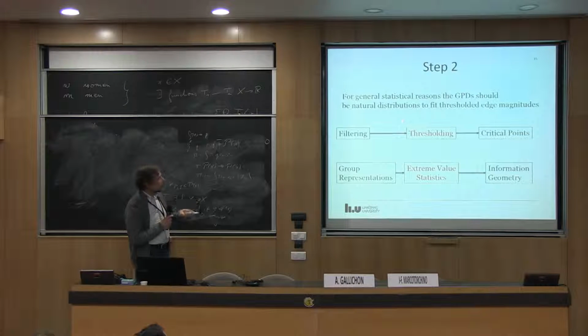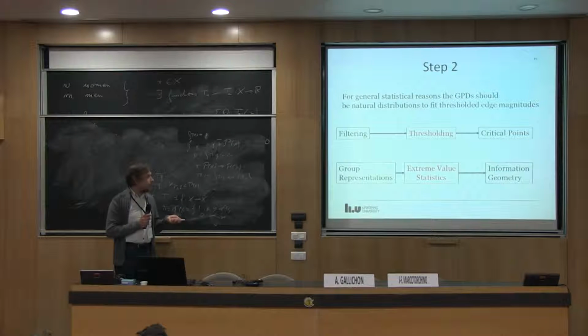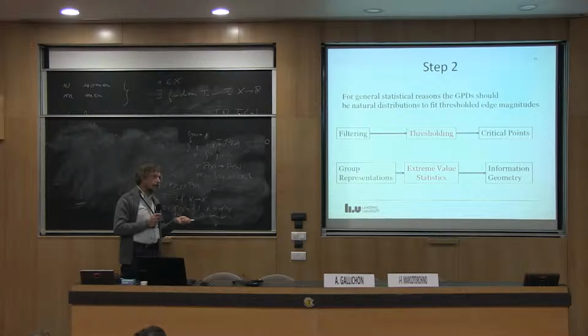And apart from the foundation in limit theorems, you also have one very practical advantage of doing this, because the Pareto distribution tells you that you should only consider values over a relatively large threshold, which means that most of the garbage that you compute in the first step, you don't need to consider anyway.